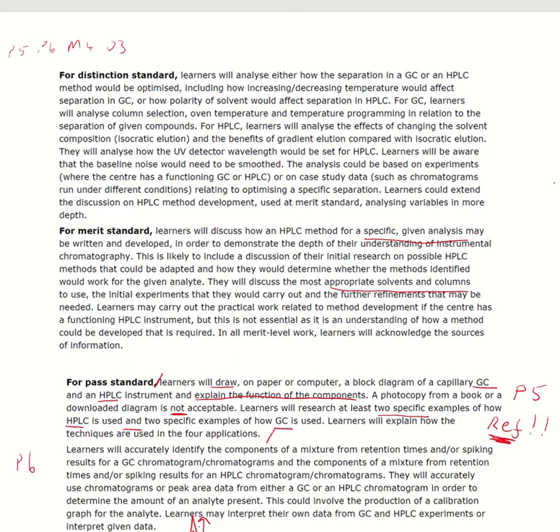E.g., you would Google caffeine. Is it a polar or non-polar molecule? So do you want your solvents and the columns to either be polar, non-polar, or one of each? And then you would talk about, well, if you did a run through and the peak appeared right near the start, so we had a peak that was more or less instantaneous, is that good? Or do you want a bit of time for it?